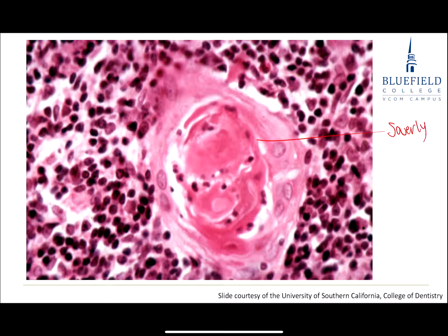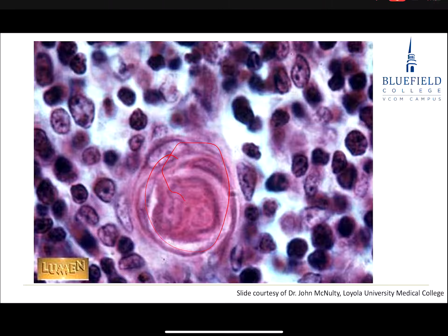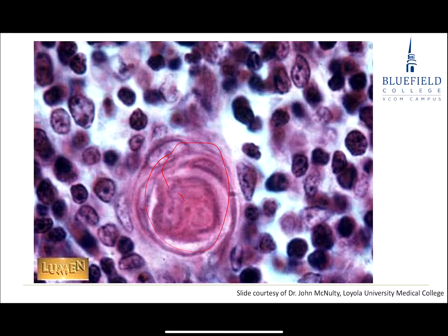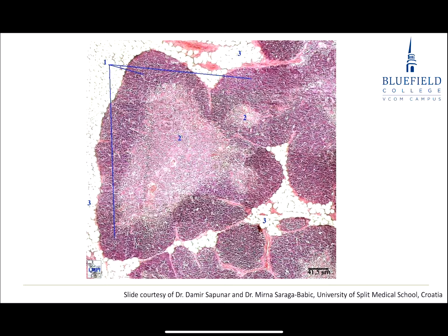Okay? All right, if I look right here, here is a thymus that has involuted a little bit. How do I know that? Look at all the adipose. They're labeled, I've got 3 with the adipose, but you see plenty of adipose tissue in there moving in. It's divided into lobes. Maybe the adipose tissue is dividing some into lobes, but the lobe here has a dark outer cortex, a lighter inner medulla.